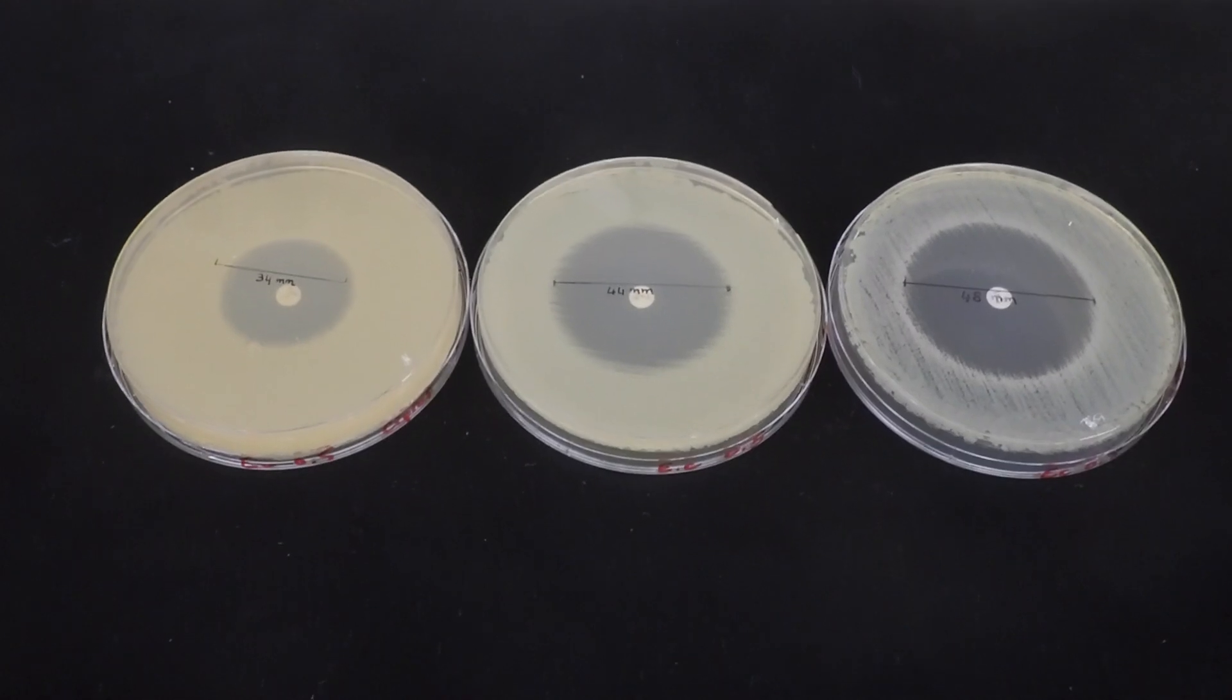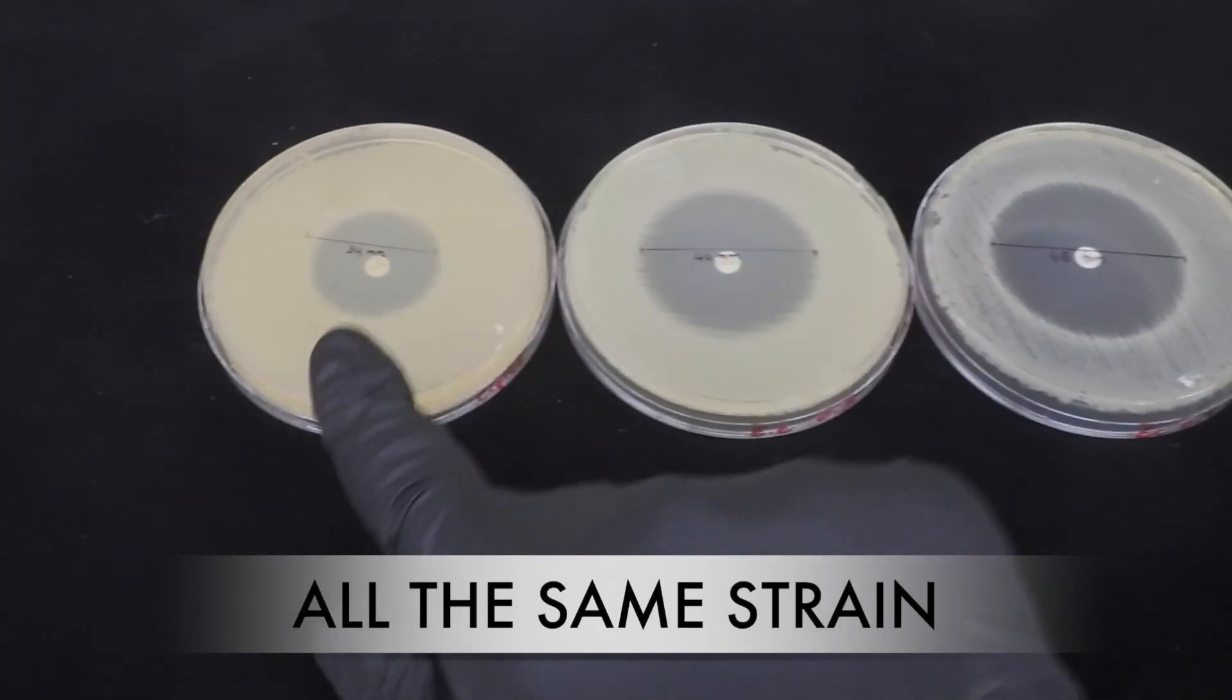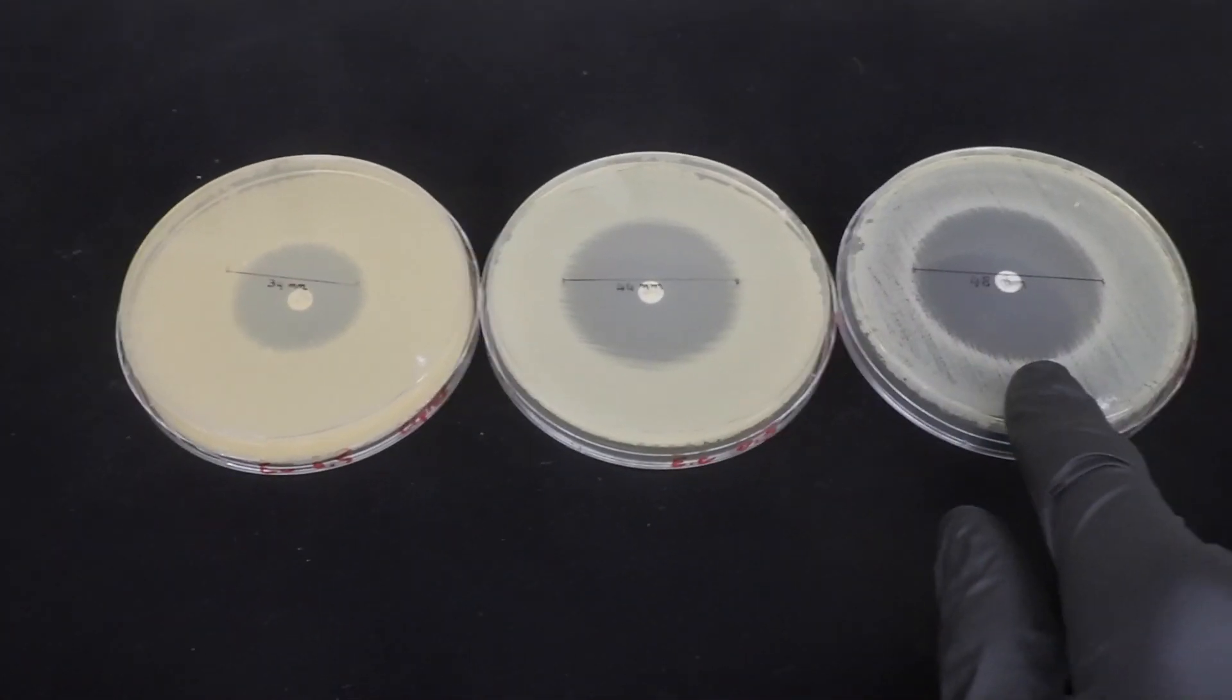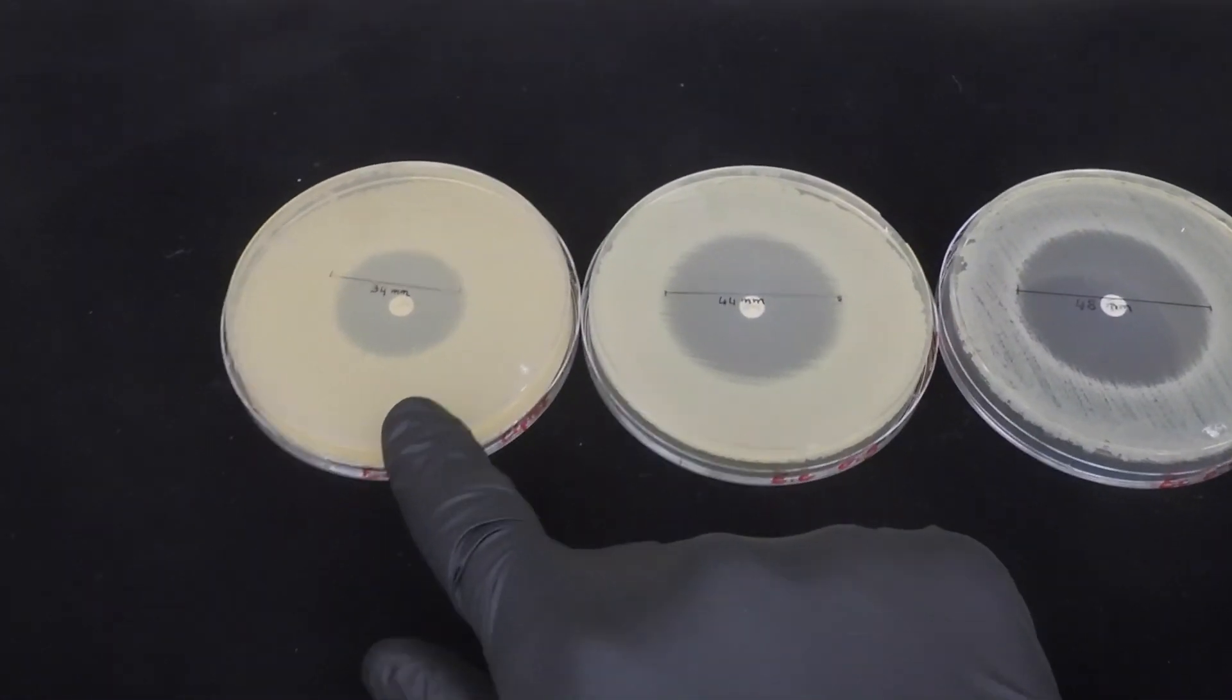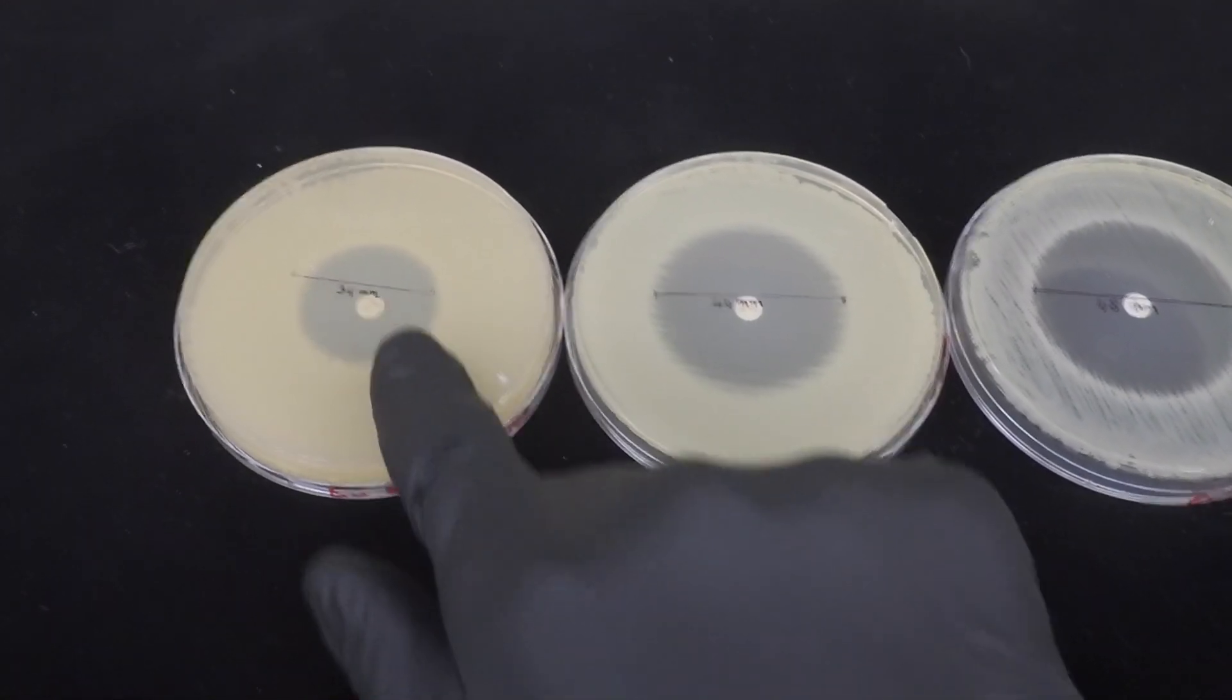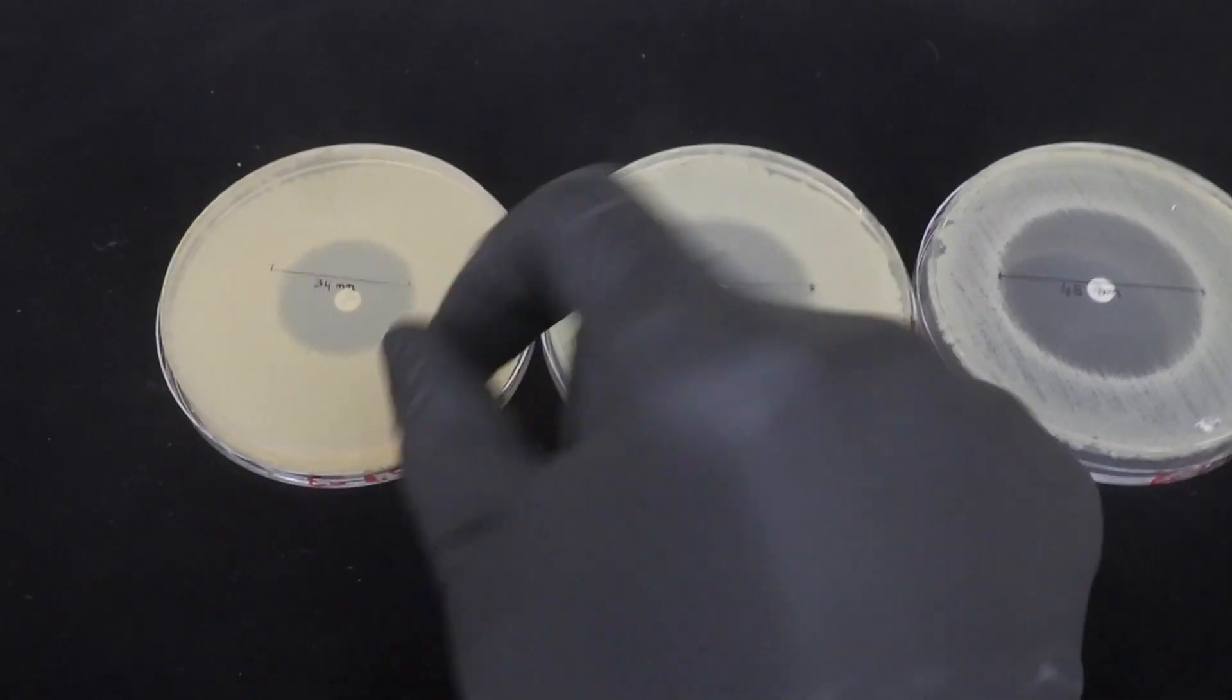In these three plates what you can see is a ciprofloxacin disc test done on E. coli. On the left, center, and right we have agar with different depths. On the far left we have our thickest media with our narrowest inhibitory zone indicating that the drug is diffusing more down than out.